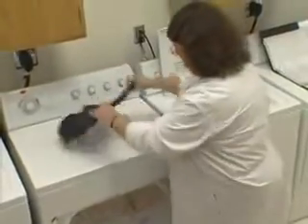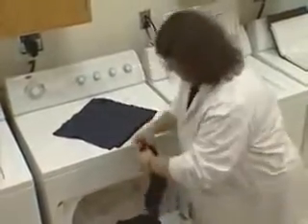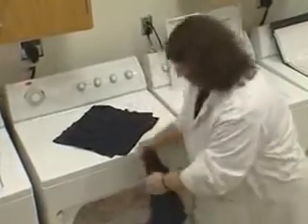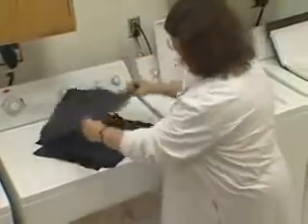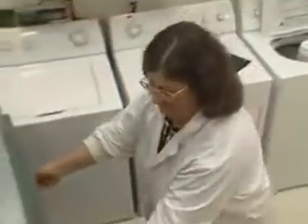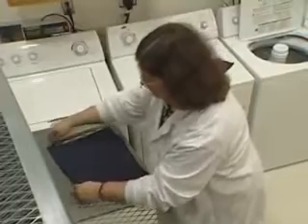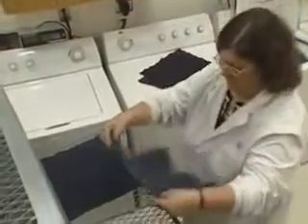One of the most important steps in measuring dimensional change is that of specimen handling following drying. Knitted and woven fabrics should be handled differently. Remove knitted specimens from the dryer after the final drying cycle and place flat on a conditioning rack. Remember, knitted fabrics are easily distorted. If knits are hung prior to measuring dimensional change, they will elongate in length, thereby falsifying the data.